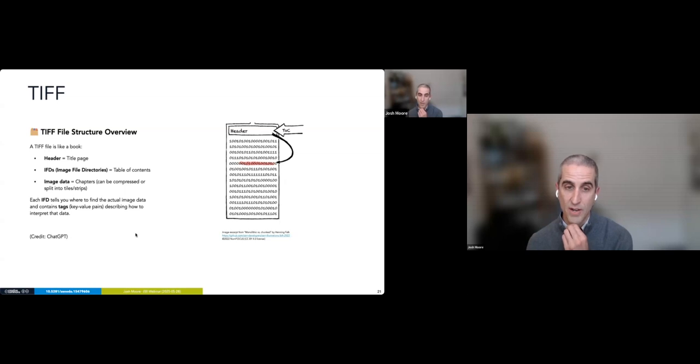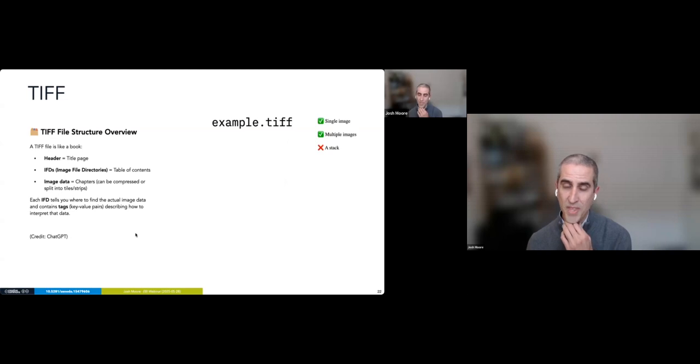It's coming from a very non-scientific background. And so that's the full model of what TIFF gets you. And what that means is that when you have a TIFF on disk, you know what it is, but if you ask a computer what it is, at most, it's either a single image or a list of images. It's not necessarily a 3D stack that you have acquired or a time lapse that you've acquired. Fundamentally, a computer doesn't know what your one TIFF is.